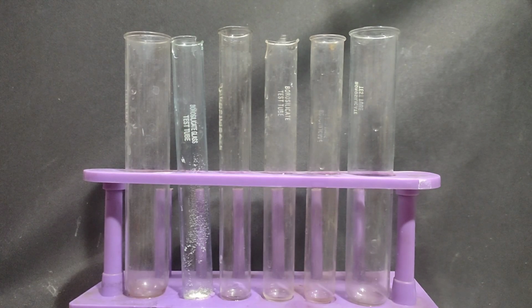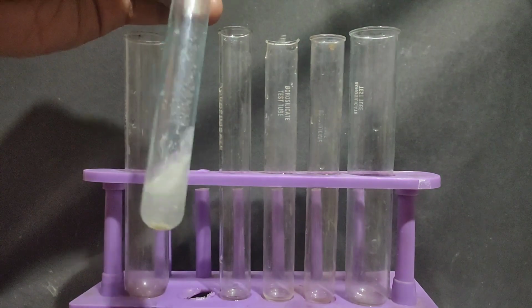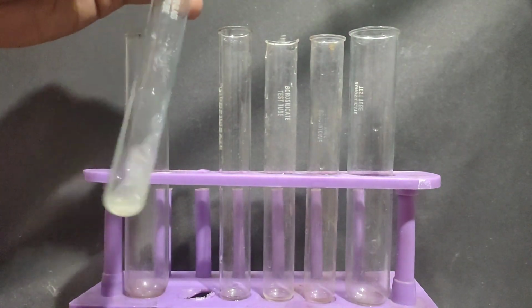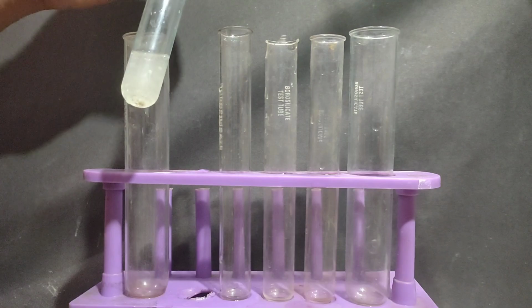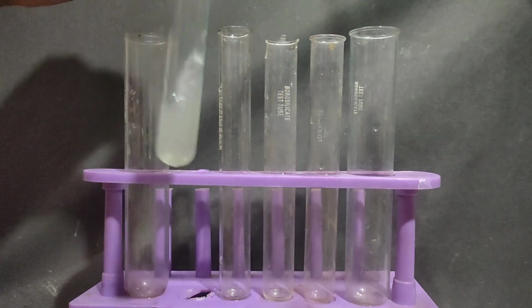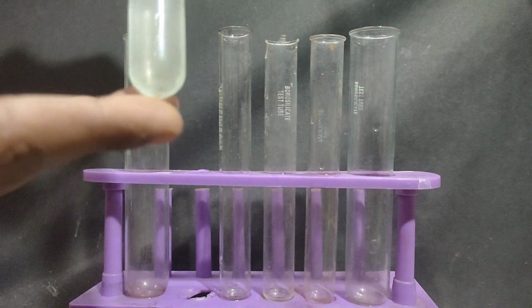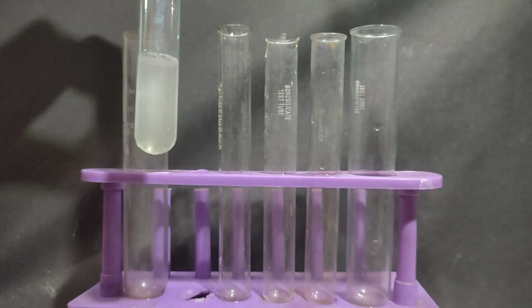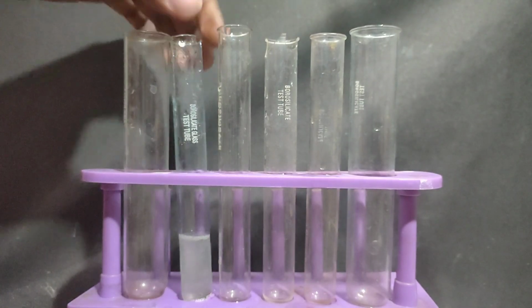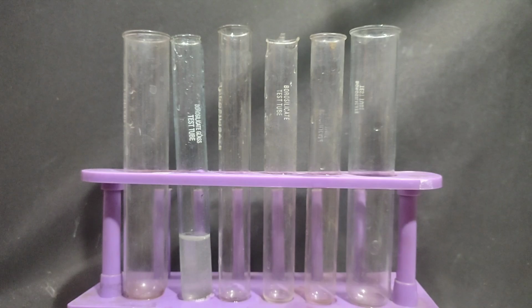So I will directly proceed with making the original solution. I'm adding some distilled water over here because lead nitrate is soluble in distilled water. So I have to dissolve it completely. If you see that some solid is left which is not dissolved, you can filter this solution and use the filtrate for original solution. I think the white colored precipitate which I can see is due to the hydrolysis of lead nitrate.